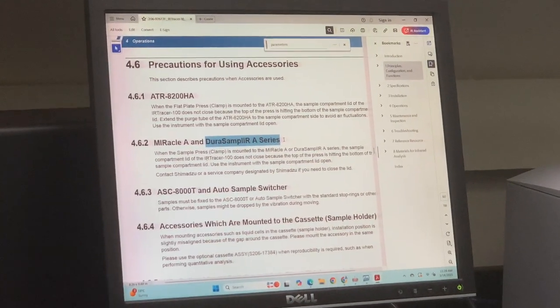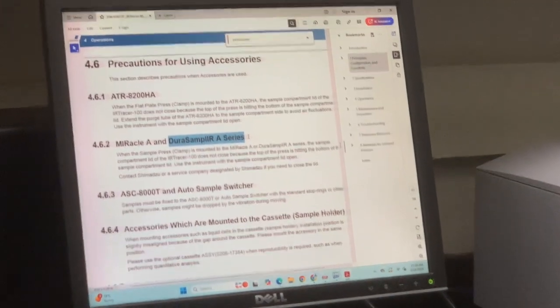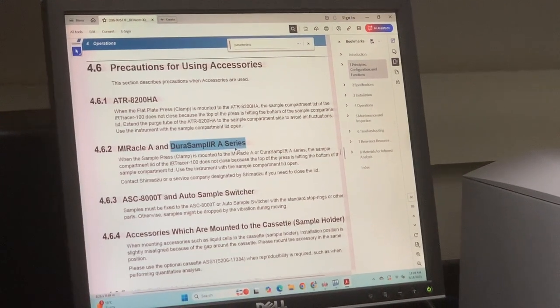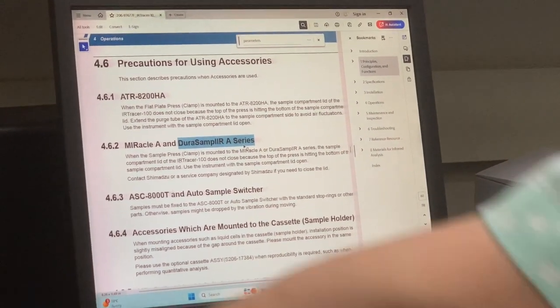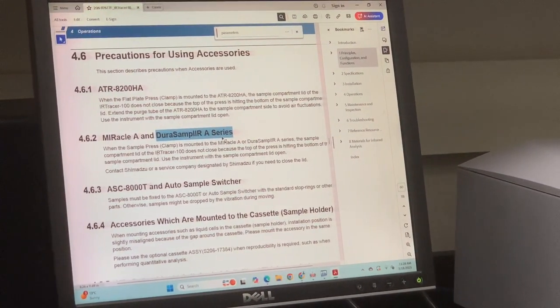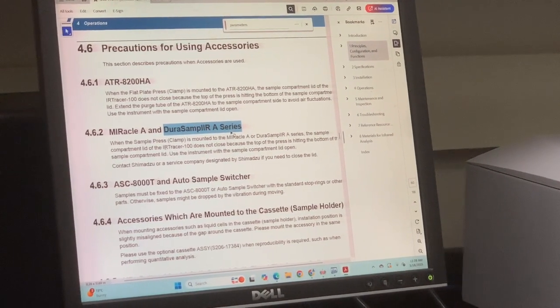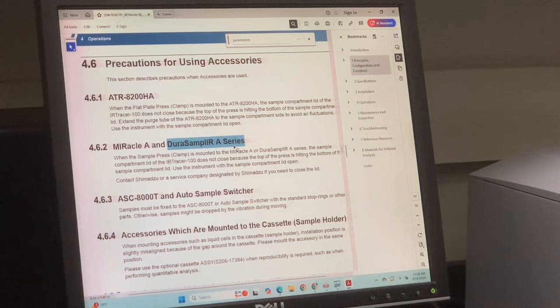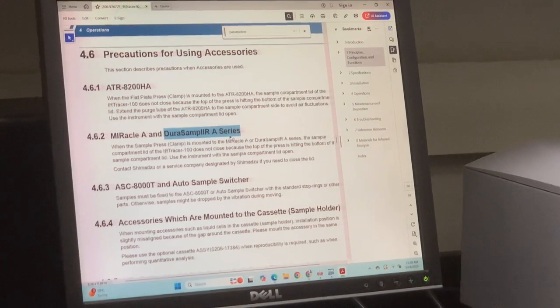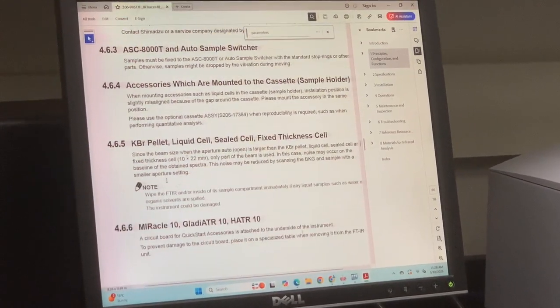So we have the IR, the standard of that polystyrene with the normal IR, and then if there's an accessory, for example, if we took this polystyrene and had the ATR pressed down on it, it would give a very similar spectrum, but it would be associated with a different library because the data was acquired in a different way, or with a different accessory. So that can explain why there are all those different hits of the same polystyrene.